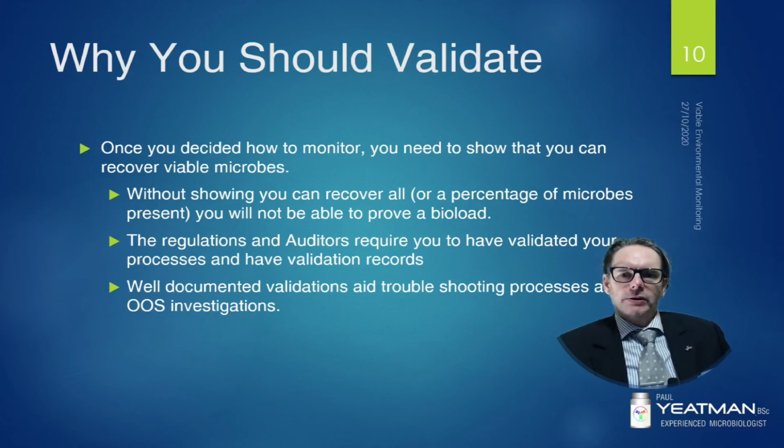If you were to introduce a new sampling technique or sampling equipment today, you must make sure you develop and enact a validation study to show your method and/or equipment is capable of recovering microbes from what you want to sample, and such sampling represents minimal risk to the integrity of the product being manufactured while you are doing the sampling. So there's no point, say, taking an air sample directly over filling needles if doing that is going to compromise the batch.